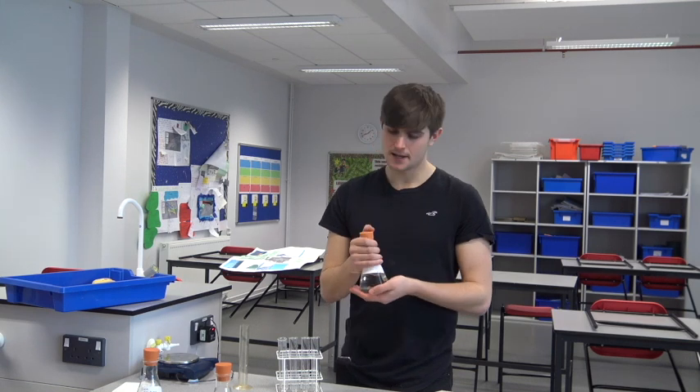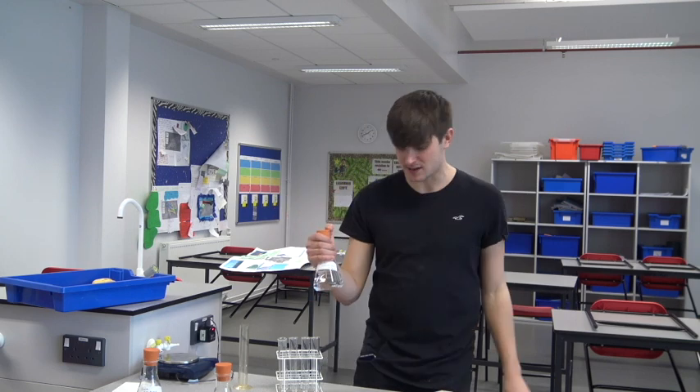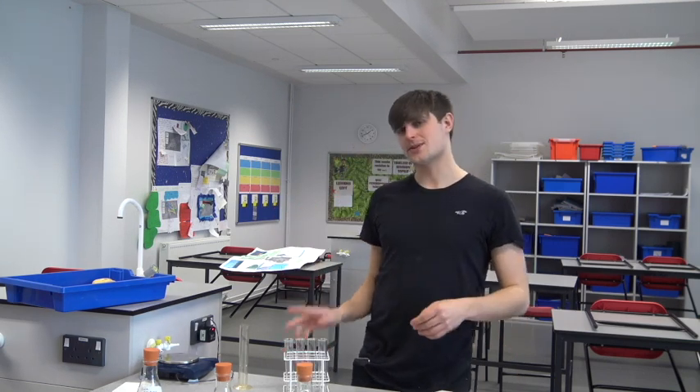Over here we have a hypotonic solution where the water actually diffused into the potato chips. If the concentration is the same, we can say that solution is isotonic — and that's what happened with this 0.2 molar salt solution. The concentration of water inside it was almost the same as in the potato chip; it went down slightly, but not very much at all.